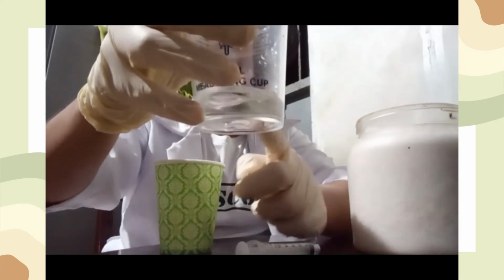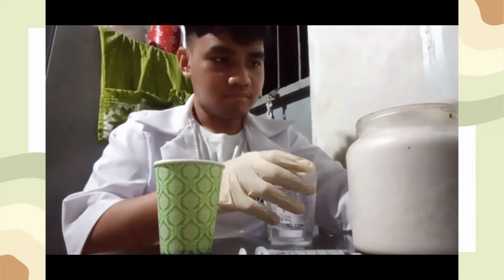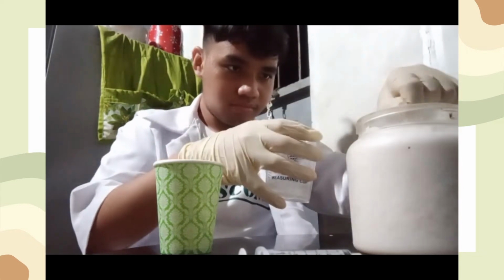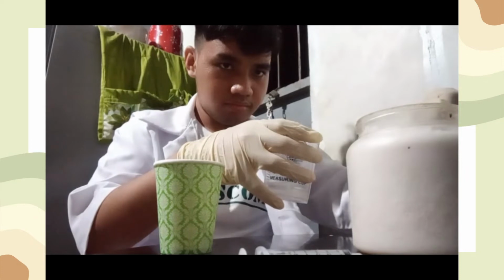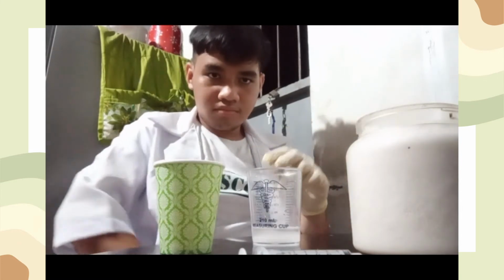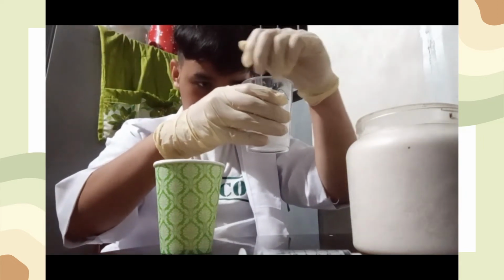First, we're gonna prepare 2 large scoops of salt and 25 ml of distilled water. We're gonna create a saline solution in a beaker by adding 2 large scoops of salt to approximately 25 ml of distilled water. And then after this, we're gonna get a spoon to stir until the salt is completely dissolved in the beaker.